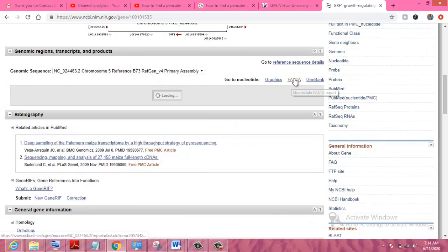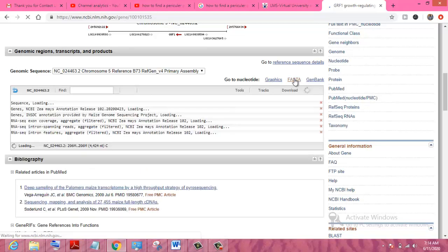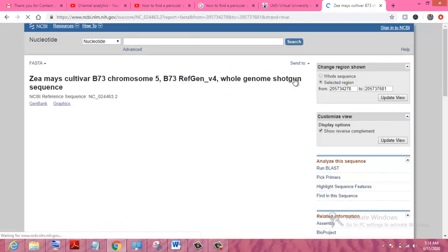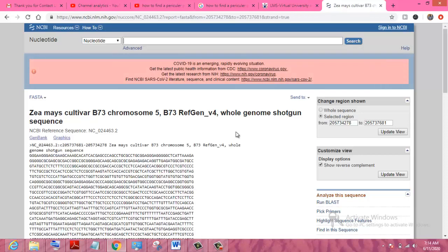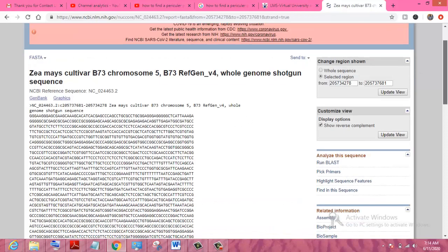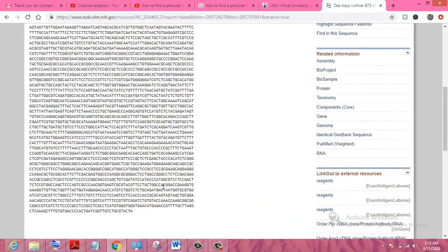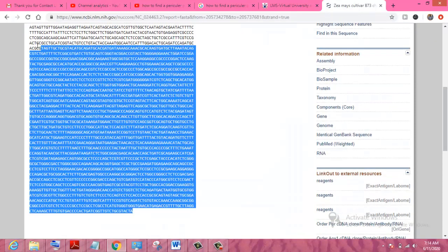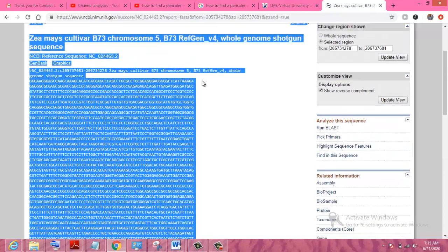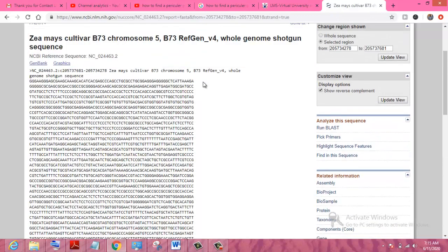Click on FASTA and a next window will appear, showing the different results in FASTA format. You can see this is the sequence of the whole gene. This sequence will provide you the sequence of the protein. Here we can search a particular protein within the gene.